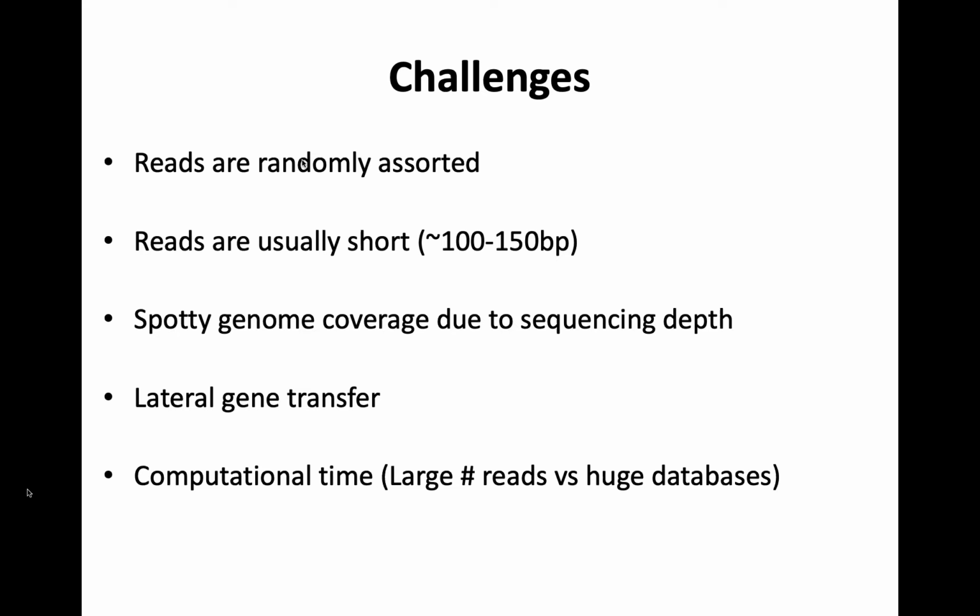And one thing we can't forget about is computational time. So we're talking about a very large number of reads, 10 million reads per sample. In a typical experiment, we're talking 50, 100 or more samples. That's quite a bit of data in your hands. And then we're comparing those to very huge databases, and we'll talk about that actually in just a few minutes. So computational time comes into play here with, hey, can we just BLAST sequences? It's like, no, you'll wait 10 years for it to be done. So we have to take shortcuts to do that and get results in a reliable amount of time.